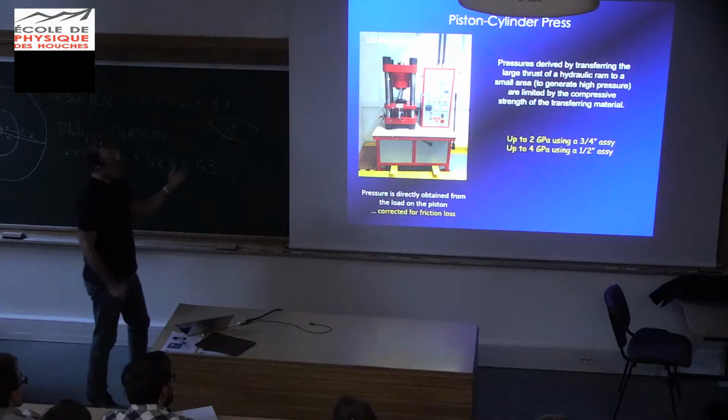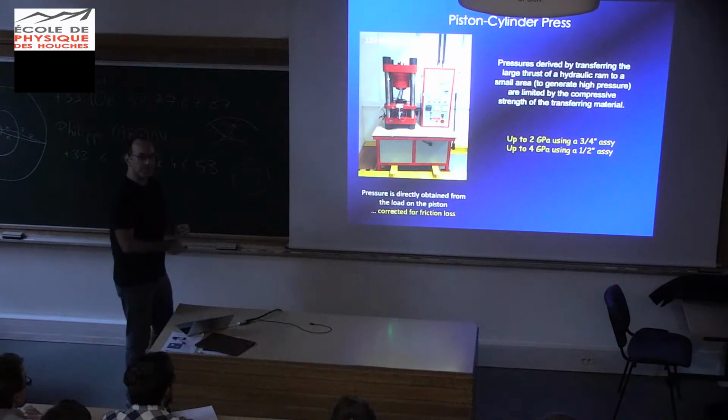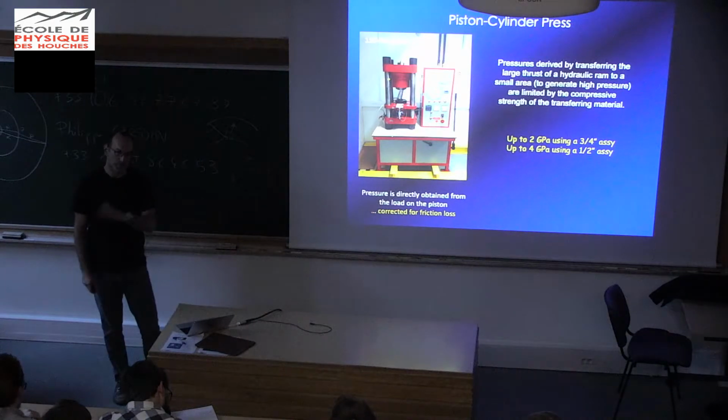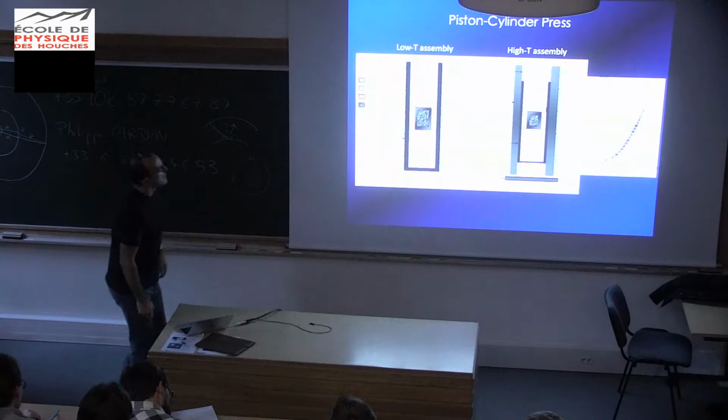So in principle, the pressure on your sample is equal to the pressure on the ram divided by the surface, but there is some friction. So you need to calibrate that loss from friction, which you do once, and then you're good to go. You calibrate this, and then you're good to go. Okay.